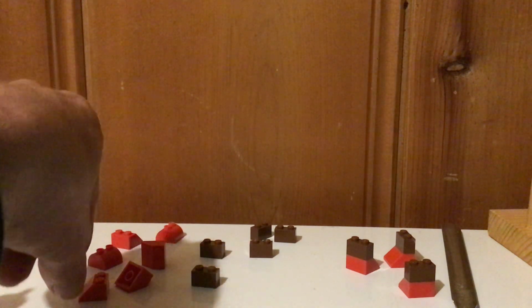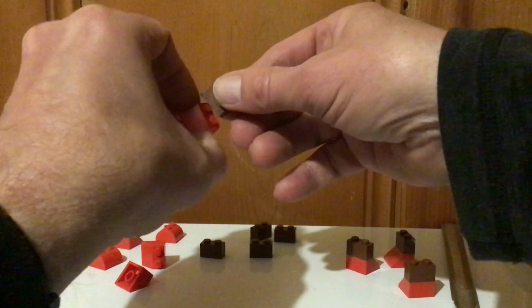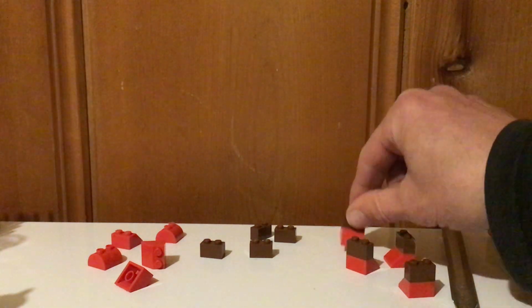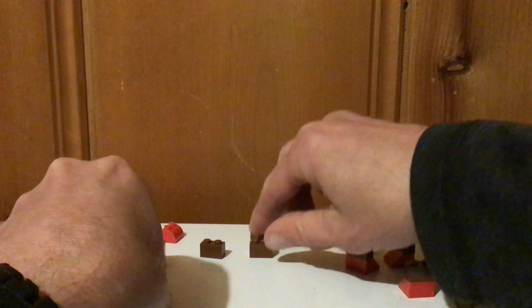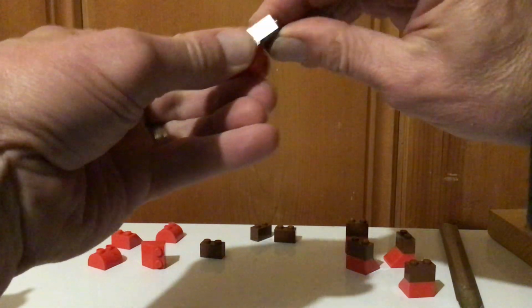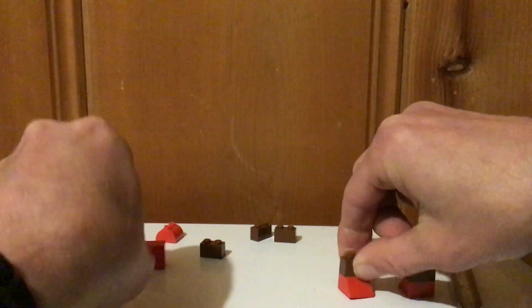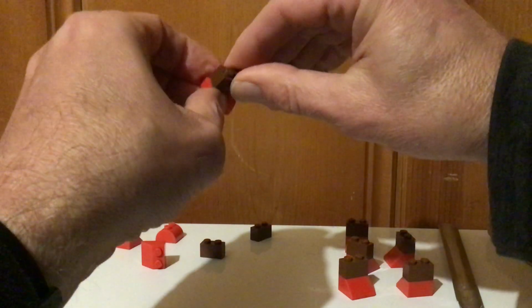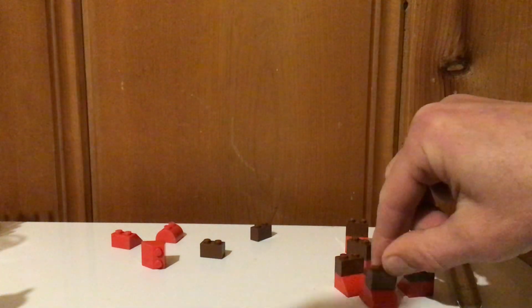So some of this that I added is going to react. Some of the Fe plus 3 that I add is going to react with SCN minus. And more of the Fe plus 3 is going to react with SCN minus to form FeSCN plus 2.